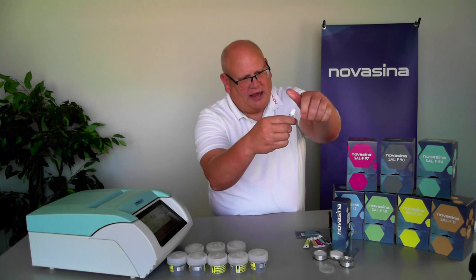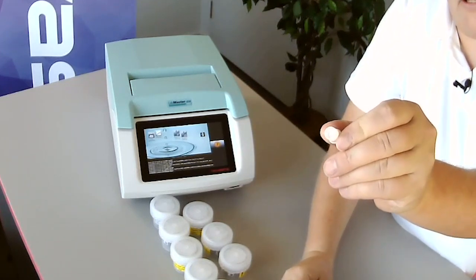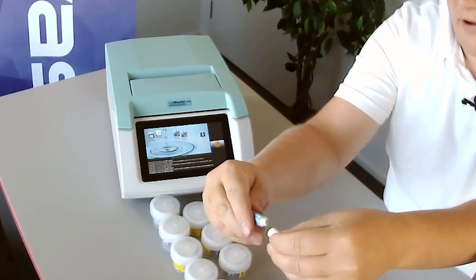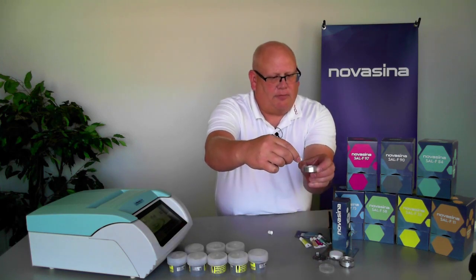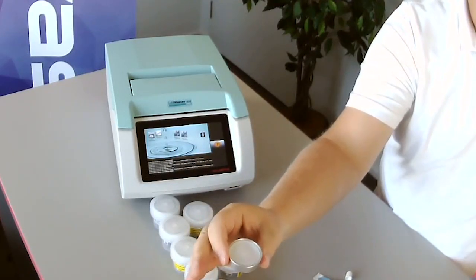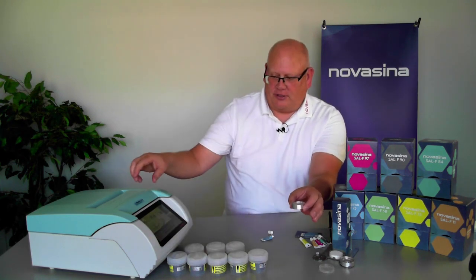Open the standard vial, and you'll see there's a seal on the standard itself that has to be punctured. There's a point on the lid that can be used for puncturing — you don't need to try to rip the seal off. Lightly puncture the seal, then take that standard and squeeze the contents into the aluminum cup with the filter paper. The filter paper absorbs the standard, which is how you can run these standards without a large amount of solution — the filter paper is a really important piece of this process.